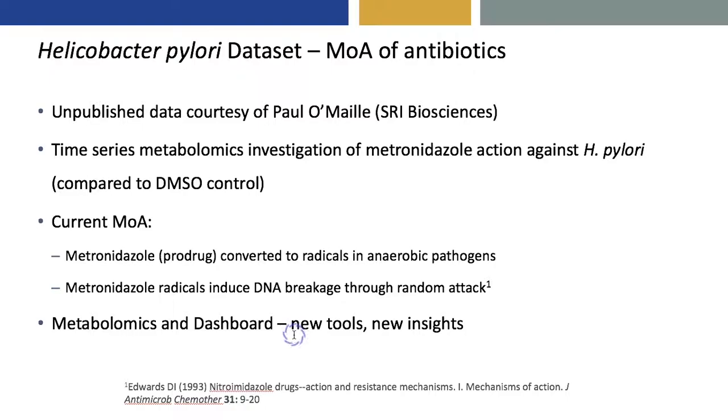Now, a little more information about the data set that we're looking at. This is a data set designed to get at the mechanism of action of a specific antibiotic, and this data comes to us courtesy of Dr. Paul O'Malley at SRI. And we're looking here at a time series metabolomics investigation of the action of metronidazole against H. pylori compared to a DMSO control.